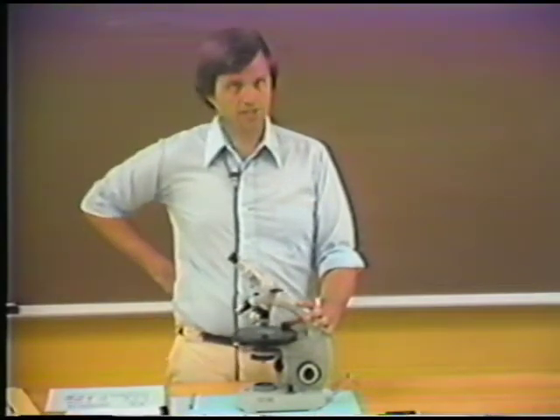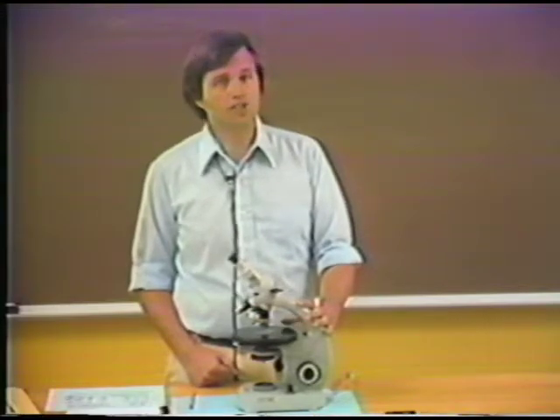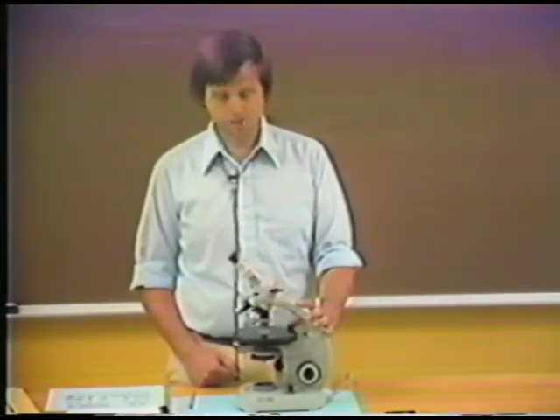Now, the refractive index that we can examine in this kind of orientation from this kind of figure is the refractive index omega. And because the section of the indicatrix that we're looking at is circular, the orientation of the stage of the microscope matters not at all. And we can measure omega in any orientation of the stage.